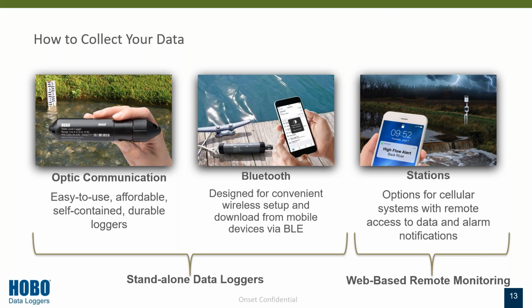Or let's say maybe you don't have that many, or you're working inside a lab and you don't need to travel. I'd say the base station is a good go-to. You just need your laptop device with you on site, and then you hook up the logger to the base station and then the base station to your computer. And then you're able to do the offloading that way.